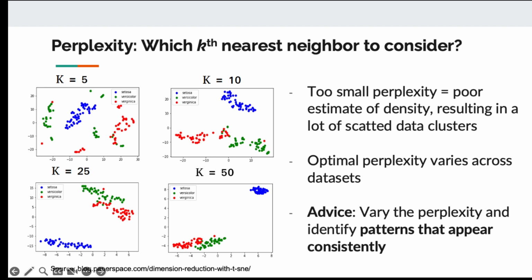And this can guide you to select the appropriate k, for which there are a lot of options. Everything in this range works. So you don't have to worry about trying k equal to 11, 12, 13, 14. Everything in the same range will work.